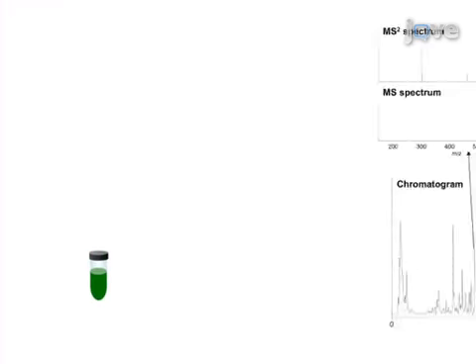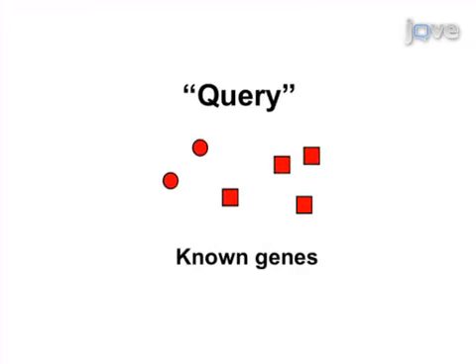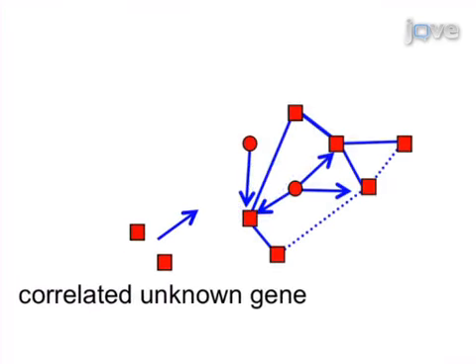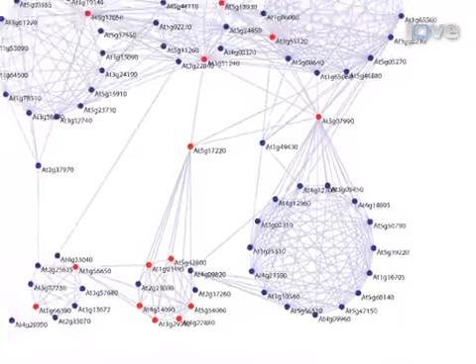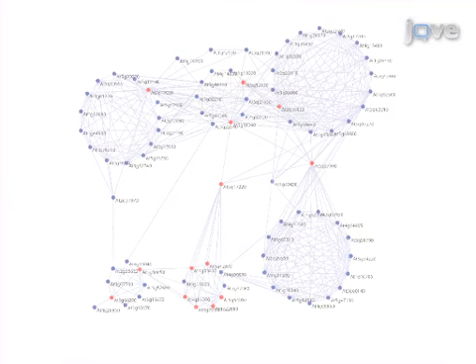As a second step, analytical approaches are used to construct the whole metabolic pathway based on the chemical structures of detected compounds. Next, the structure of the predicted pathway is integrated with co-expression analysis for narrowing down candidate genes which putatively indicate key genes of metabolism. Ultimately, results are obtained by performing minimum sets of experiments with efficient use of several bioresources in order to characterize functional identification of genes.